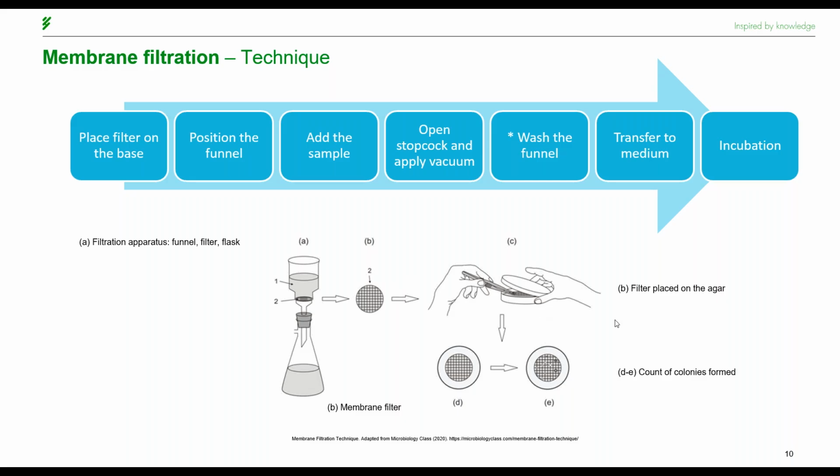It can usually be placed on the surface of an agar plate with the grid facing up, and extreme care must be taken to place the membrane flat on the surface of the agar, so we avoid any air bubbles forming between the agar and the membrane.